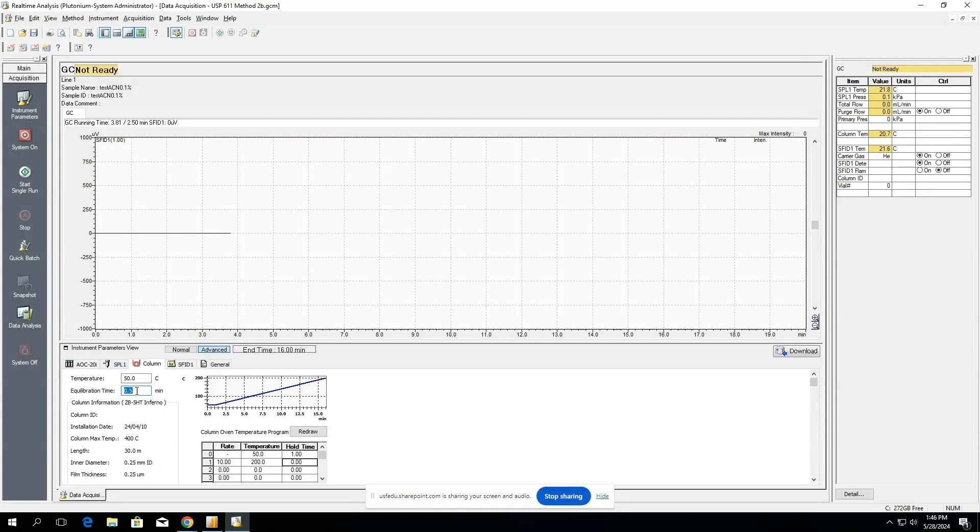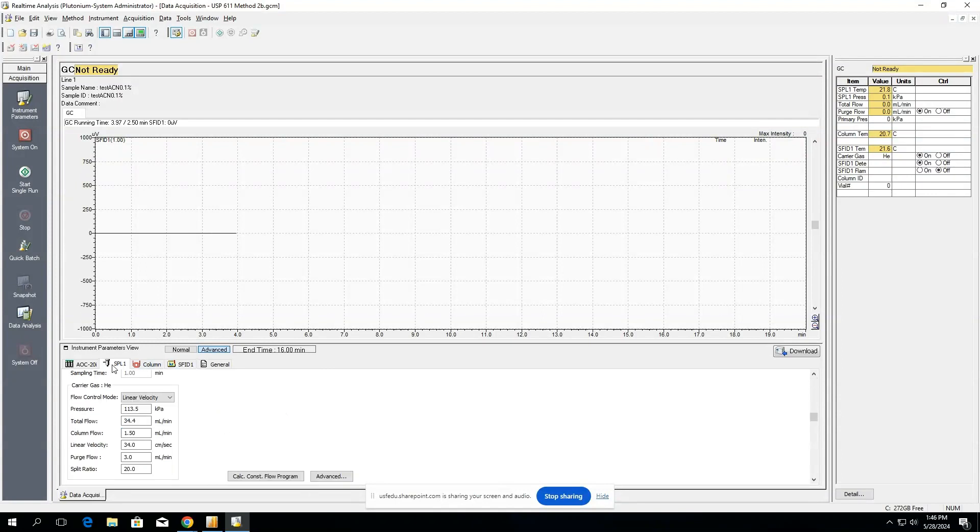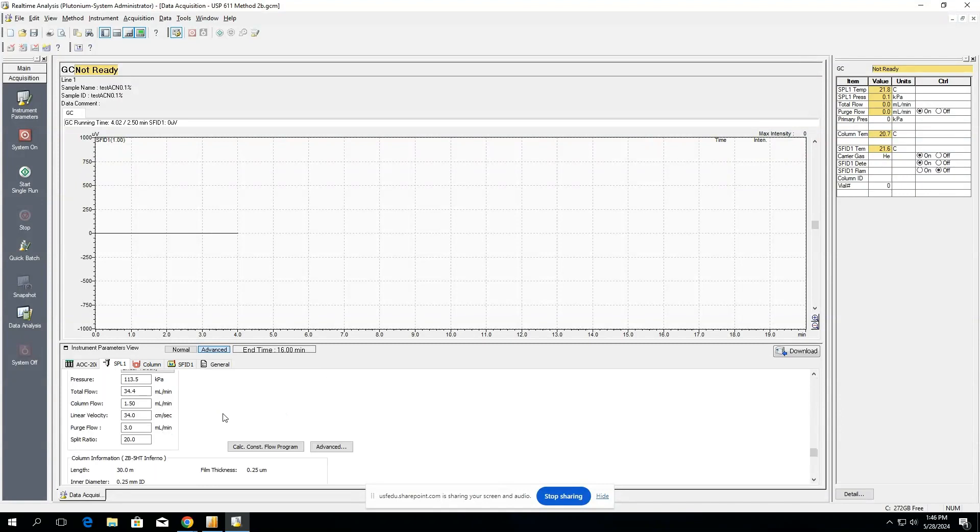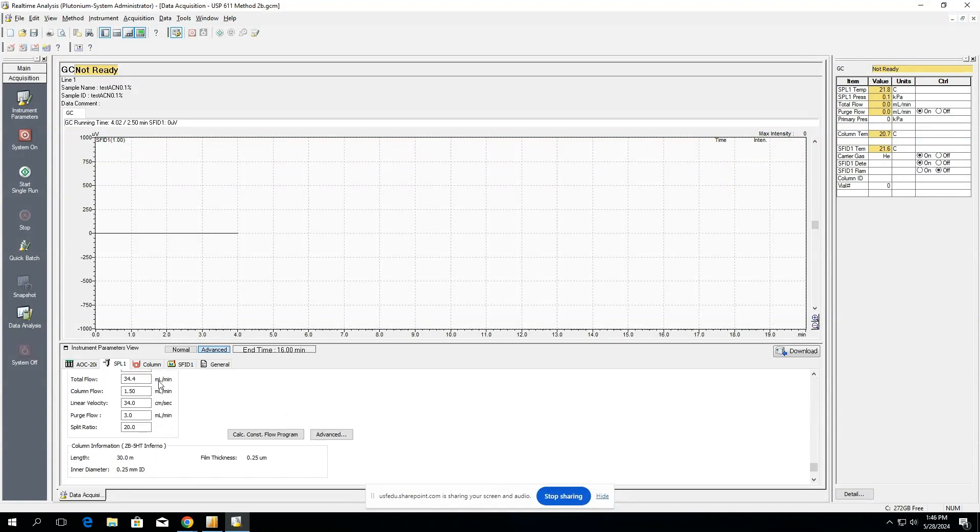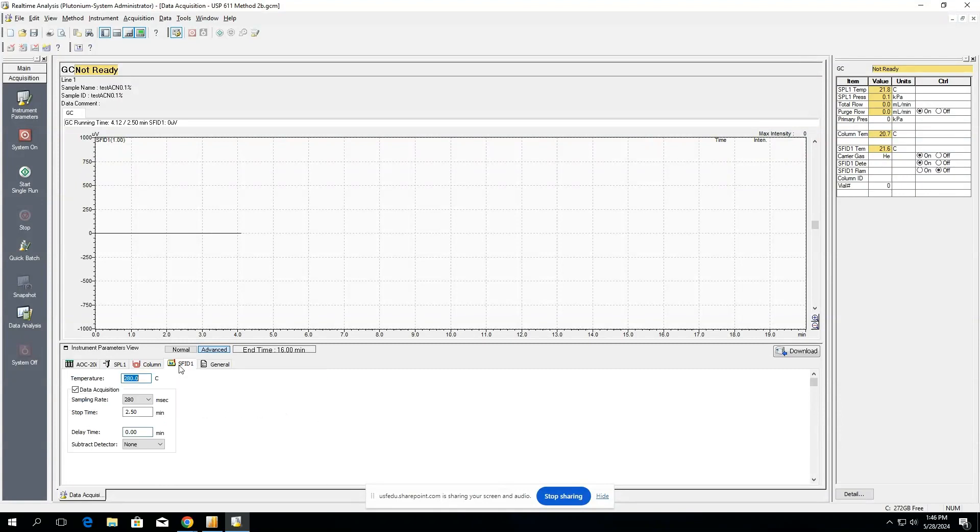So this equilibration time and this delay time will seem like additive time if you're running repeat injections using the same method. So we've covered how to set up our injector, our column, and our detector.